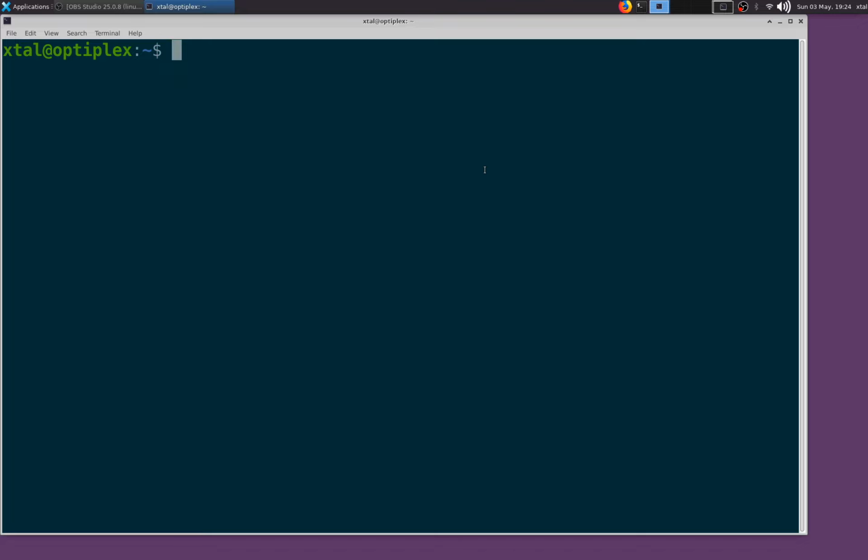Okay, so we've installed the software. Now let's solve the PSP28 structure, starting with integrating the data. So let's make a directory called solve. Integrate and XDS.